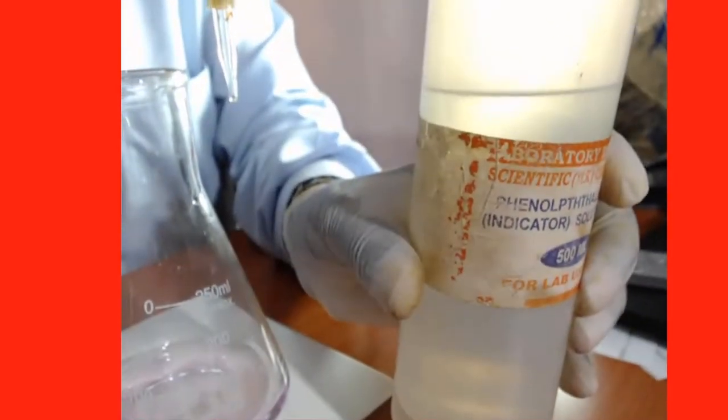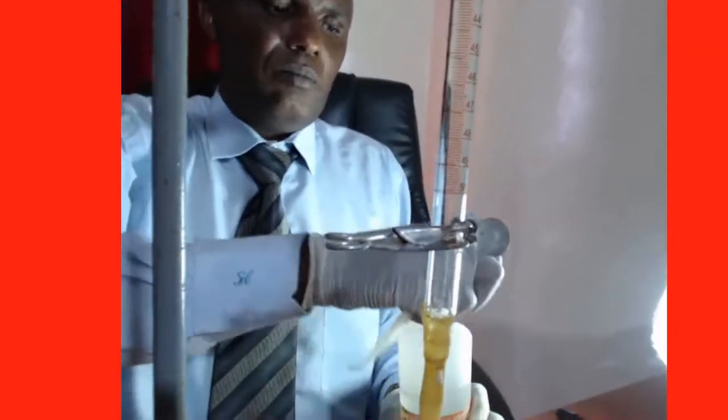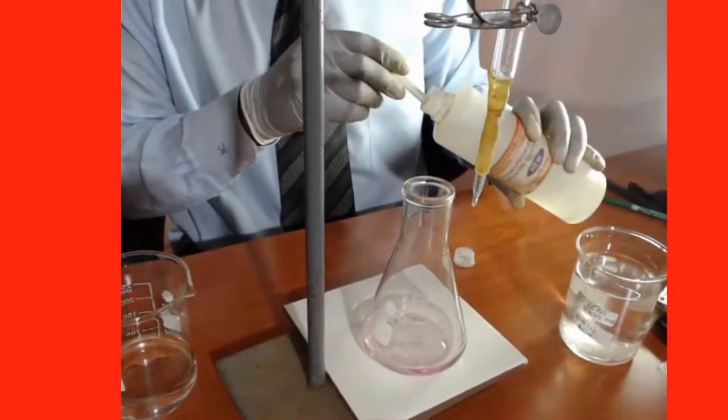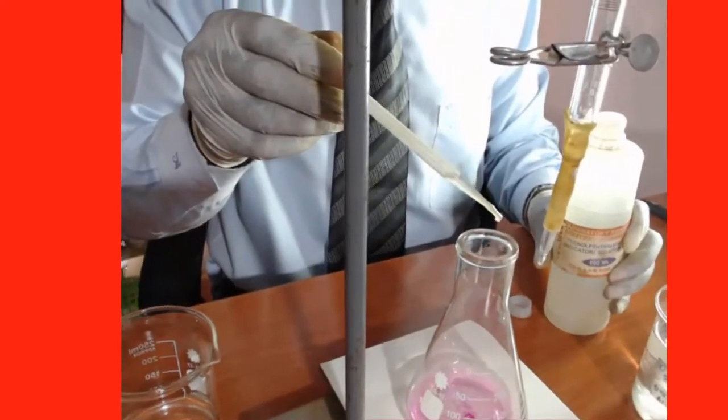Let us now put the indicator. This is a phenolphthalein indicator. We want to get 4 drops of phenolphthalein indicator. 1, 2, 3, 4.